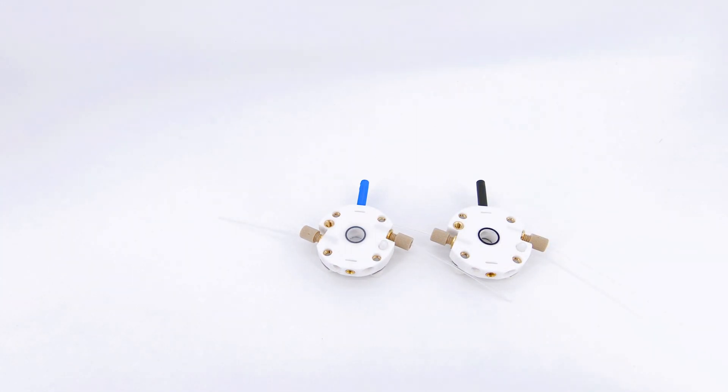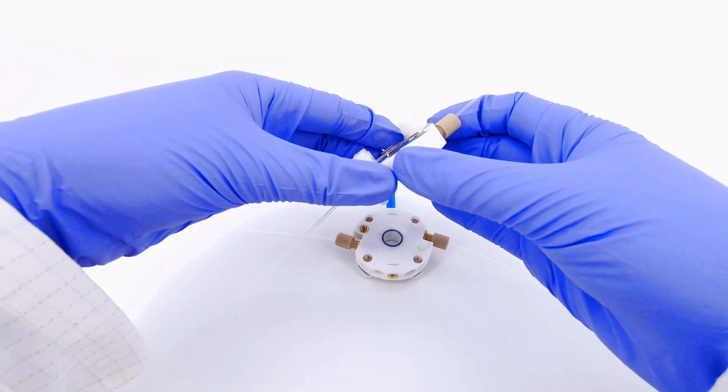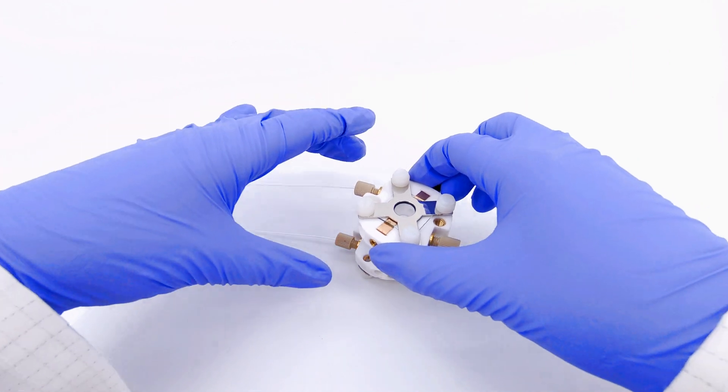Place a membrane onto one of the halves of the flow cell and then place the other half on top of that, such that the membrane is between the two o-rings.